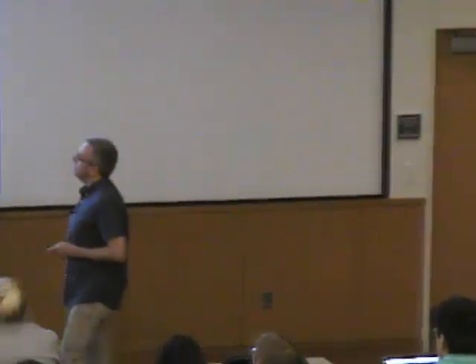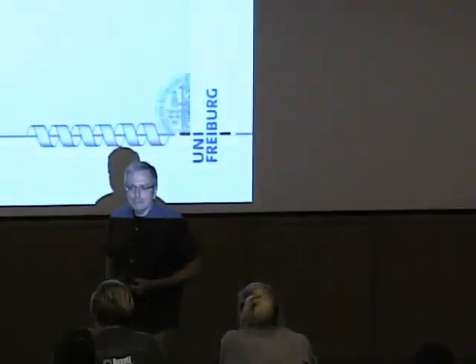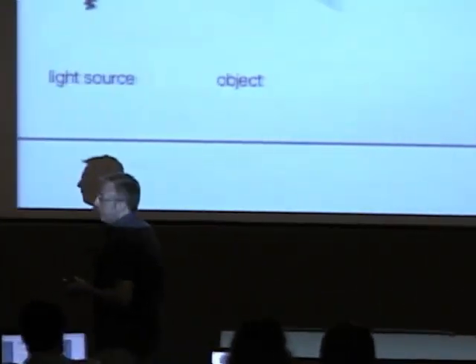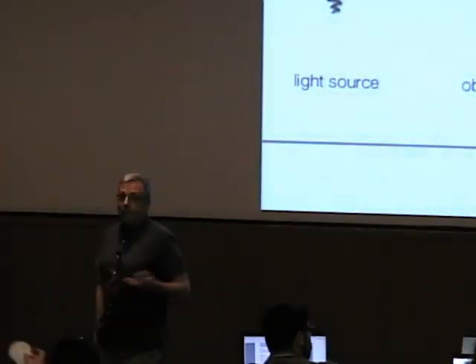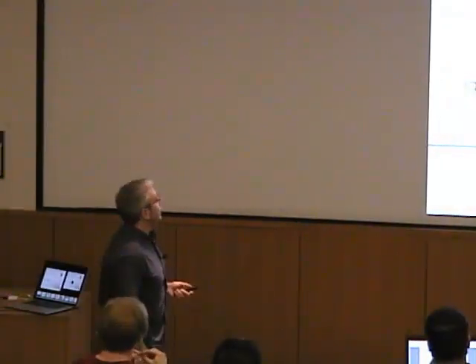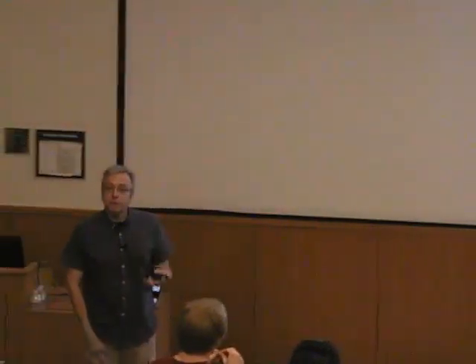Technically, we want to do something like a simple microscopy experiment where you would have an object. I'm a biologist by training, so that's the kind of object I would be looking at. You would shine light at it, and you would choose that light to be of the proper wavelength to be actually diffracted by that object. Then, of course, you could do all kinds of spectroscopies with that. That's probably what most of you would be doing. Or you put an imaging component behind it, and for optical light, that might be a lens, and that just leads you to a bigger picture of what you have.